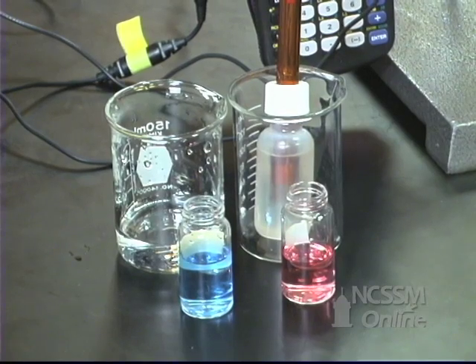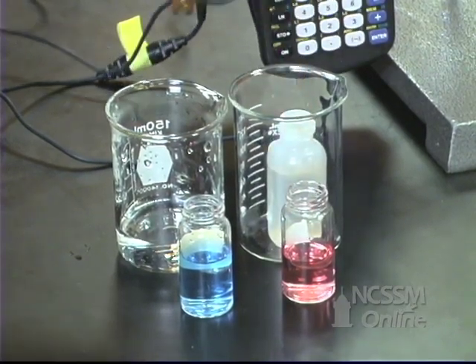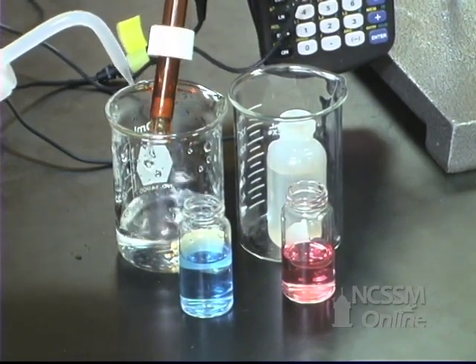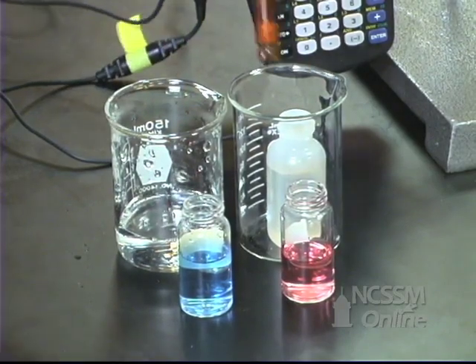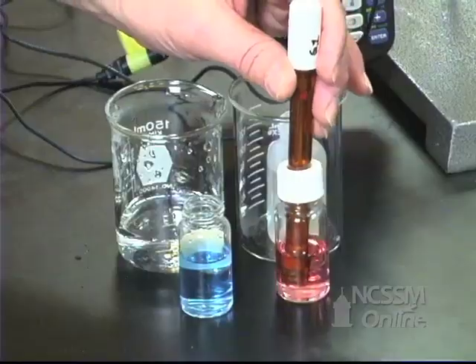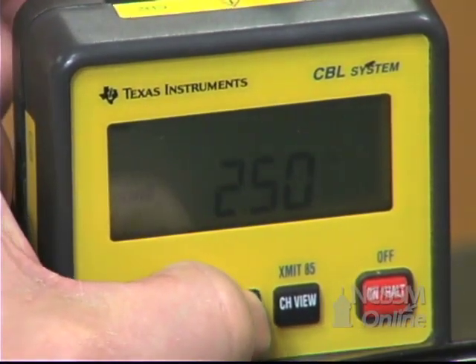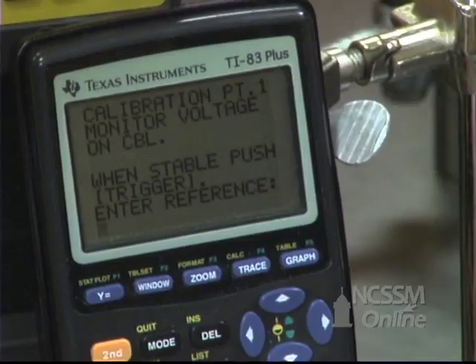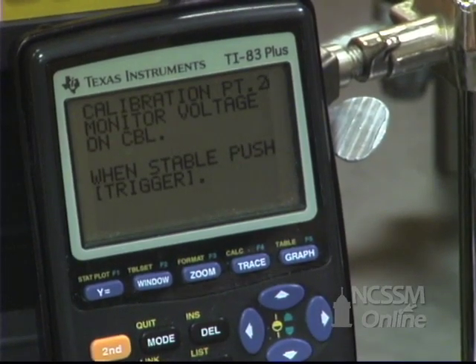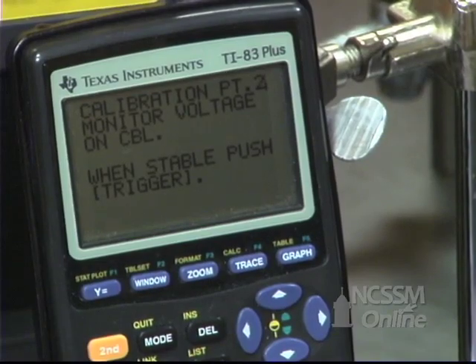We're going to standardize the pH probe. We're going to take the pH probe out of its storage solution and rinse it with water, then place it into a pH 4 buffer solution. We're going to wait until our CBL reading becomes stable, press trigger on the CBL, and enter a reference value of 4.0 on our calculator.